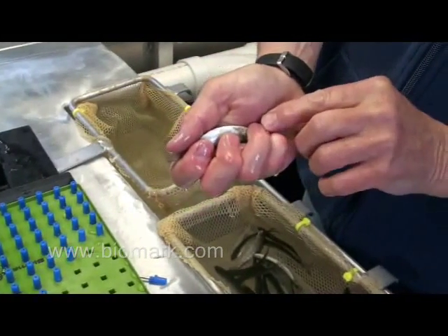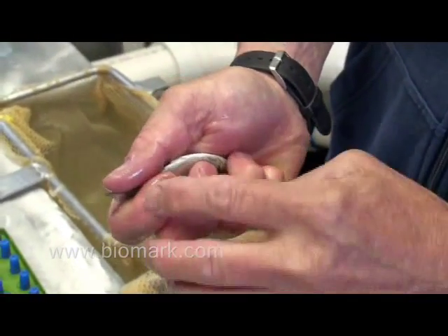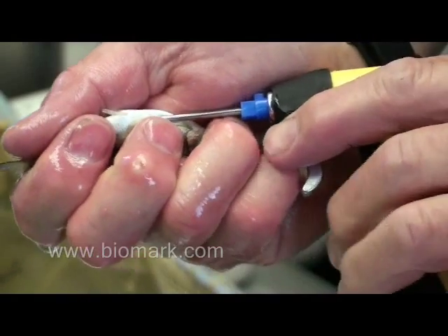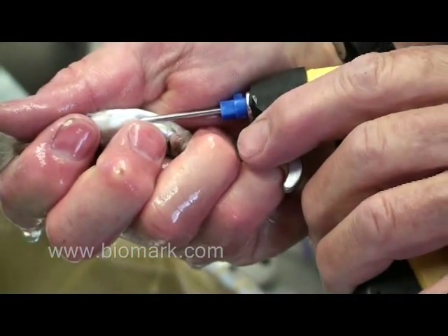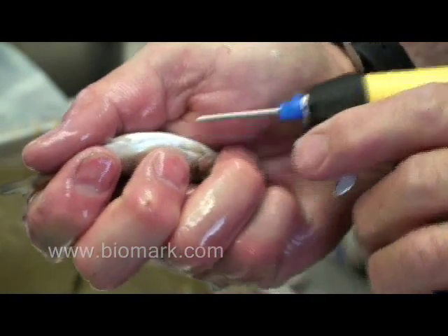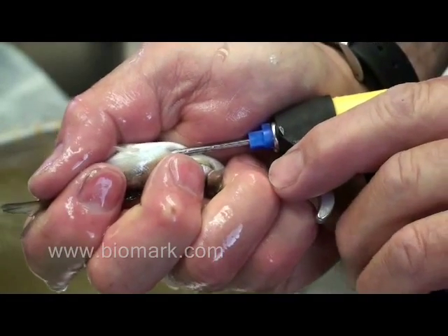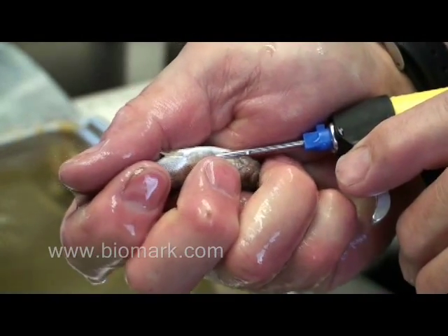I want to stress how we hold a fish. I have my finger here holding the head — I don't want to keep the fish out of water too long. This finger is bracing right about at the point where I tag the fish, and my two fingers down here are holding the tail so the fish won't slide backwards. Controlling the fish and not letting it slide in hand is very important. I try to keep my gun here — it takes very little pressure with a sharp needle. This contact gives you control; if you're out here tagging loosely, it's easy to push too hard and tag too deep.